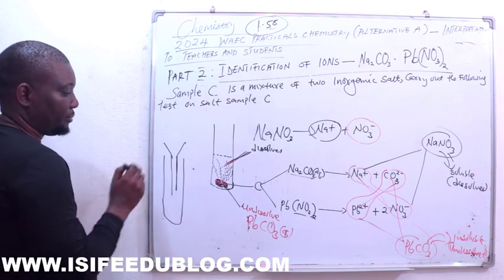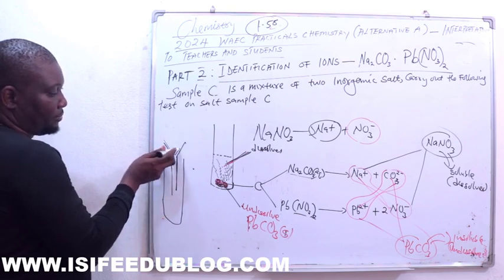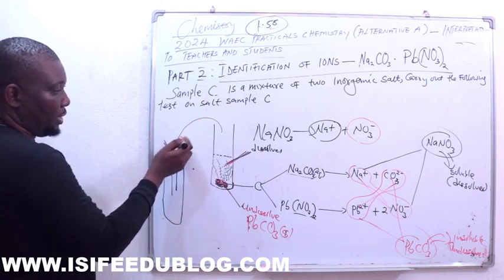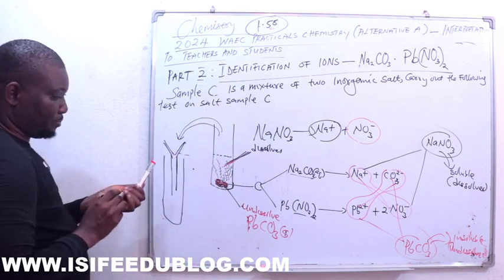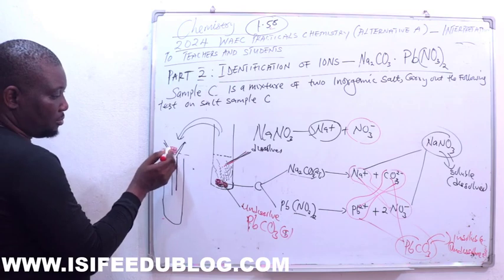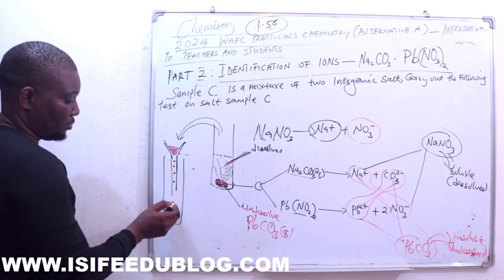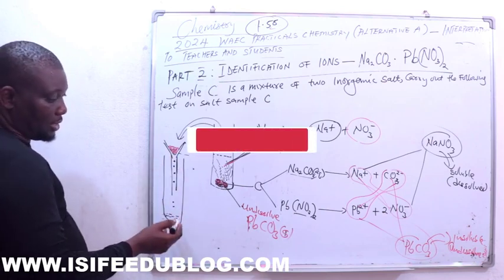This is the funnel. Clean funnel, maybe our filter paper. This is my filter paper. This is the funnel, this is the filter paper. And then I try to pour in all of this here. As I'm pouring this, these parts here will remain on this part of the paper. They won't be allowed to pass in. So you are seeing these parts going in gradually as this is draining. So this is how we'll be able to separate.